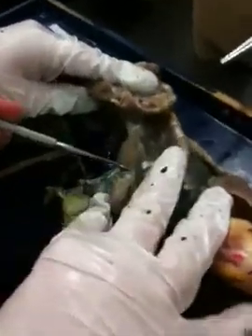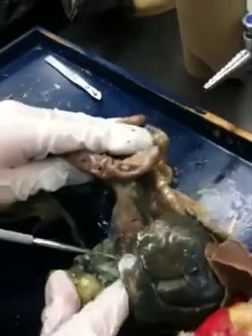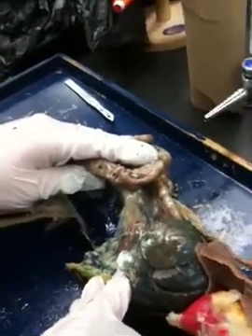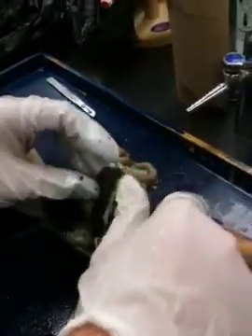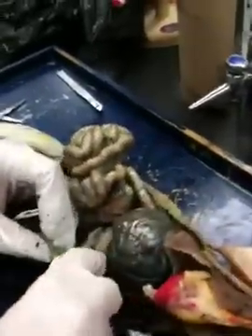Okay, underneath the stomach here, this area right here, can you see this right there? That's the pancreas. There's your pancreas. The pancreas is always going to be a little bit darker. And it's right under the stomach. Now, this thing on the side here, spleen. Yep, that's your spleen. And what are these, the kidneys? Kidneys.